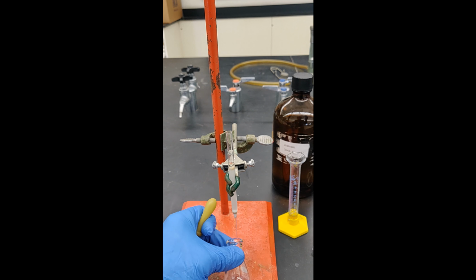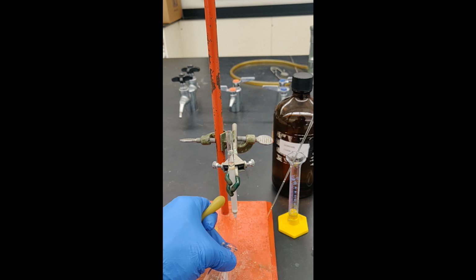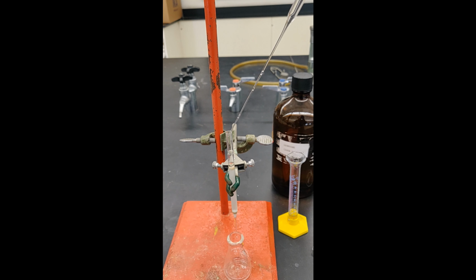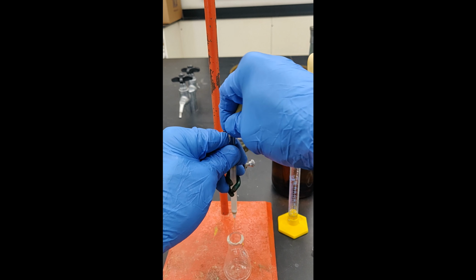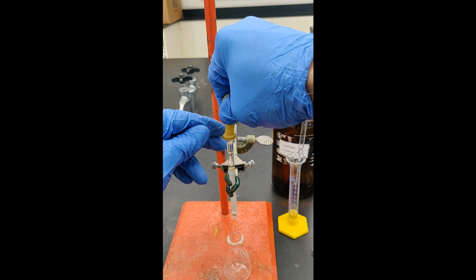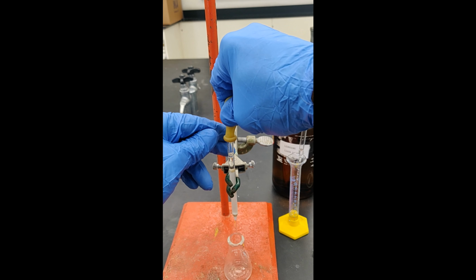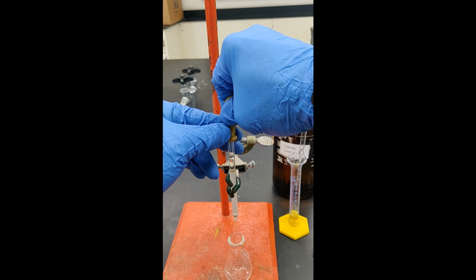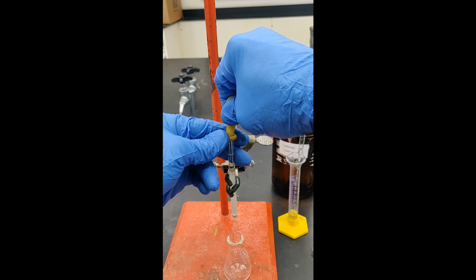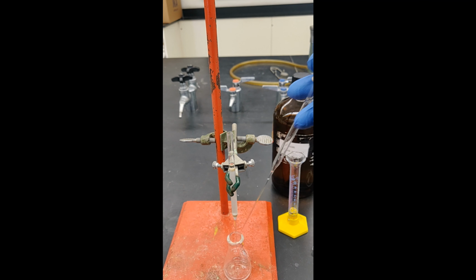When packing the column with Ligroin, you can reuse the Ligroin that has already gone through the column. Remember to have your other hand ready to help quickly dislodge the rubber bulb just as the descending liquid approaches the sand.